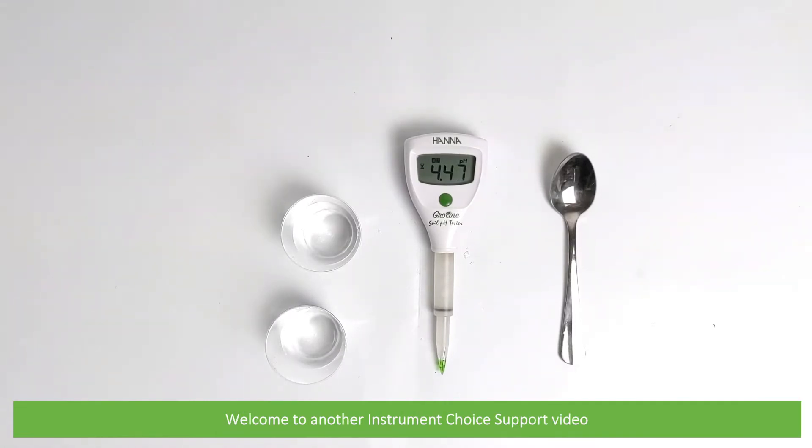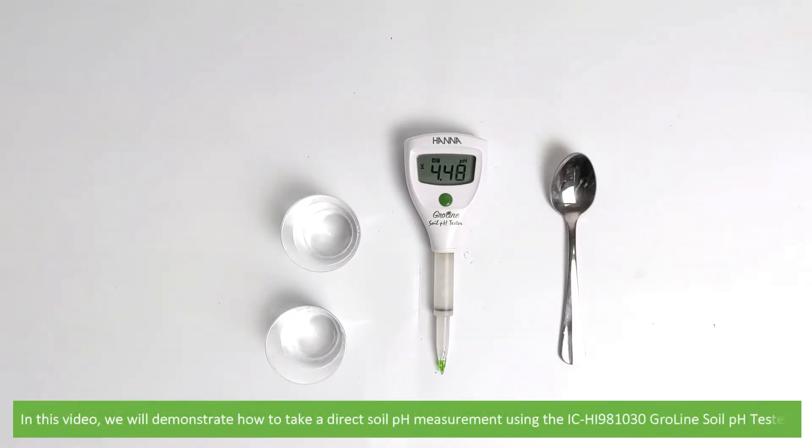Hi and welcome to another Instrument Choice support video. In this video we'll demonstrate how to take a direct soil pH measurement using the IC HI981030 Growline Soil pH Tester.